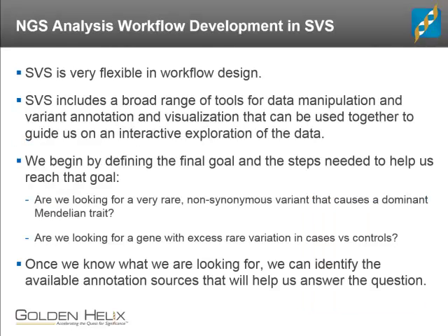Now, what you'll see in SVS is that it's very flexible in terms of workflow design. It has many different tools for data manipulation, for statistics, for summaries, for variant annotation. These things can all be used together to guide us through the data. As long as we have some idea of where we're starting and where we want to go, we can usually put together a workflow to get there.